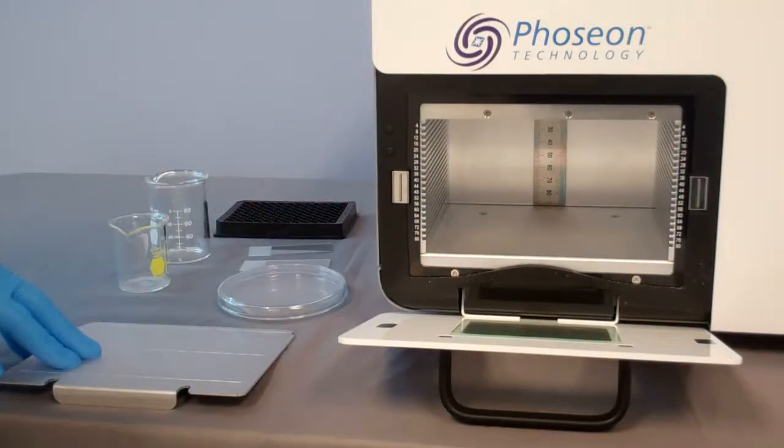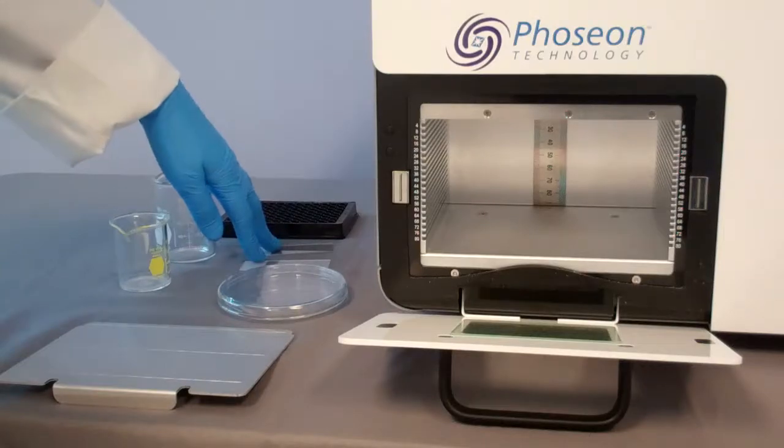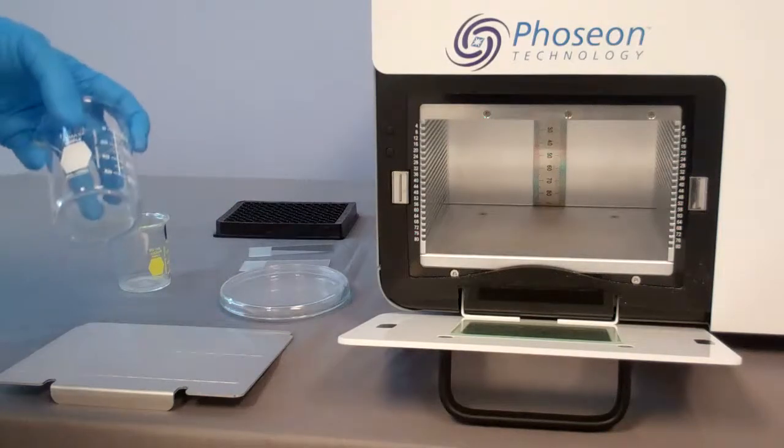The shelf allows the user to place laboratory equipment such as microplates, flasks, slides, or petri dishes underneath the emitting window at the appropriate height to allow the desired level of exposure. For example, here's how we insert a 100 milliliter beaker.